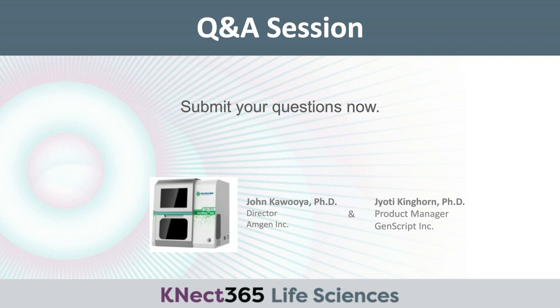Okay, anyway, yeah. Cost effective, yes. Cycle time, FTEs, number of people doing the work. The beads are still very expensive on the market. There is no doubt about it. And the price, I don't want to talk about price because I don't sell them. I just buy them, okay? So for that reason, I leave the cost different.